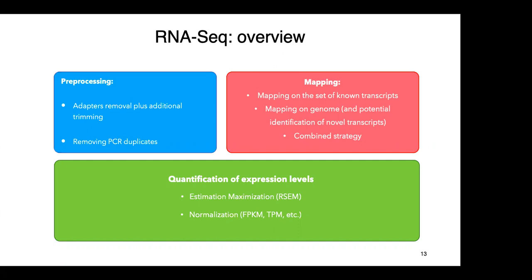Many people were asking what a pipeline is, so let me explain. This whole process is called a pipeline. A pipeline is a workflow that has interconnecting steps where each next step takes the output of the previous step. So this step will take the input from this one, from here to here, from here to here. Each next step takes the output of the previous step.